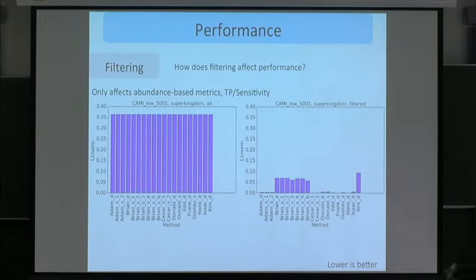Now, the reason why this filtered versus unfiltered makes such a big difference for the profilers is because, remember, a profiler just returns a list of identities and relative abundances. And pretty much none of these tools adjust for genome size at all. So even if you had a bunch of plasmids that are very small, if their abundance is 20 times everything else, then in that list, it's going to be dominated by those. And that's why you see this massive poor performance. Everybody does terrible there.